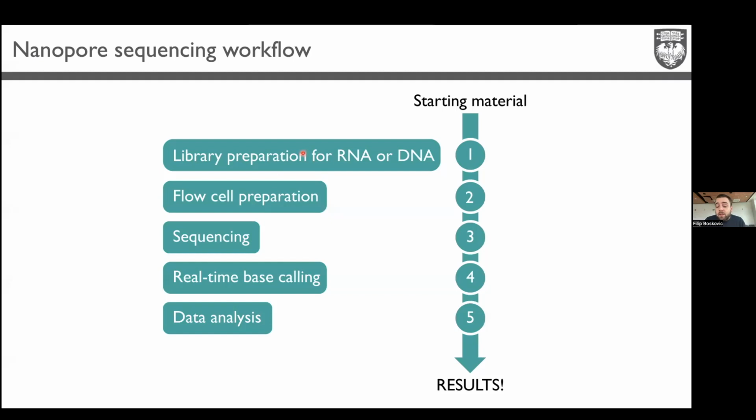And then you basically just follow it. You can even directly reference a sequence. So that's a sequence that, for example, you are looking for in a bunch of transcriptome or genome of your sample. And therefore, this actually enables you to immediately see how many molecules of those that you're looking for are in the sample, because the sequencing, compared to Illumina, is real time.